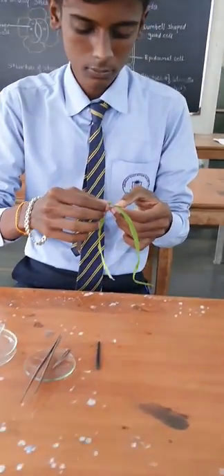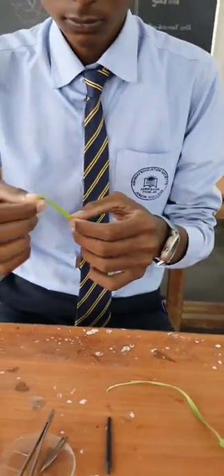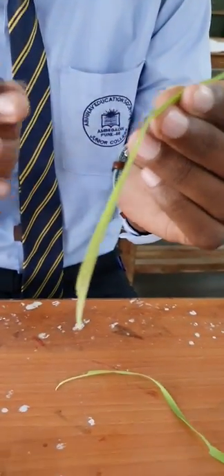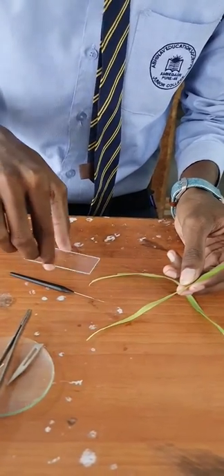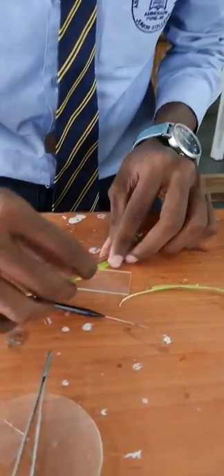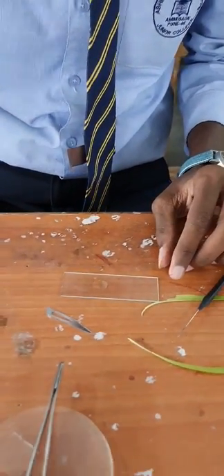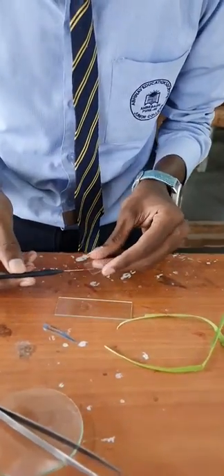Now repeat the same process for the monocot leaf. Here we are using grass to observe the stomata. Peel off the leaf as shown here. You can observe this part which we have to cut into small sections. Keep this leaf on the slide and cut this part into small sections using a razor. Add a drop of water over it and put the cover slip properly. The slide is ready to observe under the microscope.